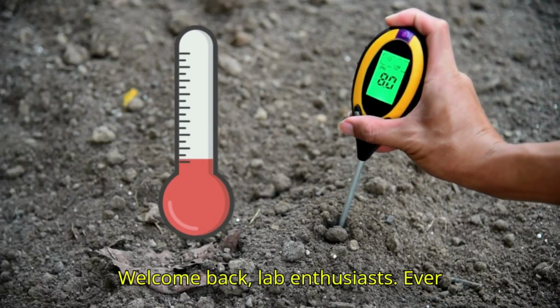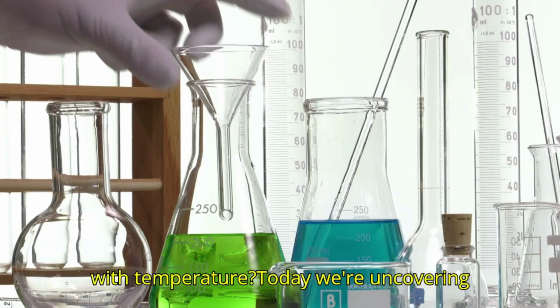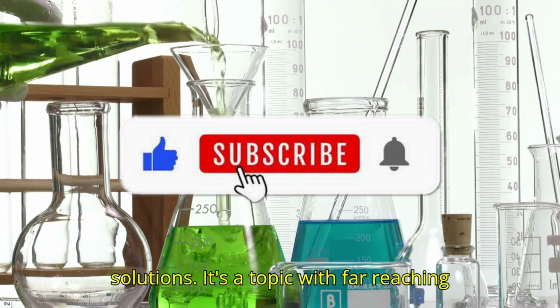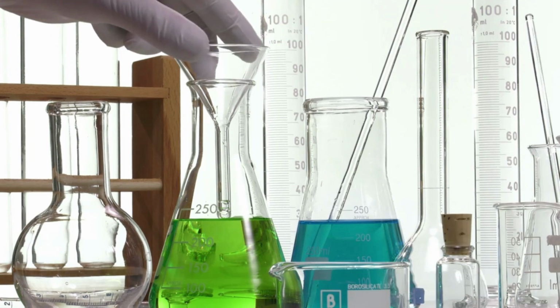Welcome back, lab enthusiasts. Ever wondered why that pH reading fluctuates with temperature? Today, we're uncovering the fascinating relationship between temperature and pH levels in lab solutions. It's a topic with far-reaching impacts, from basic chemistry to biochemistry, agriculture, and environmental science.